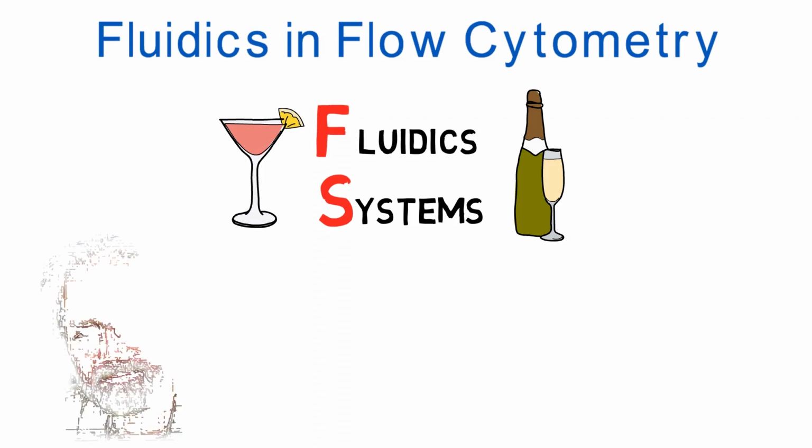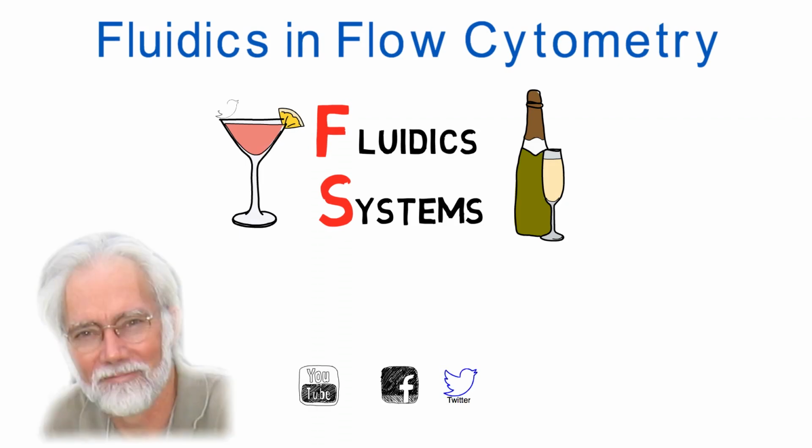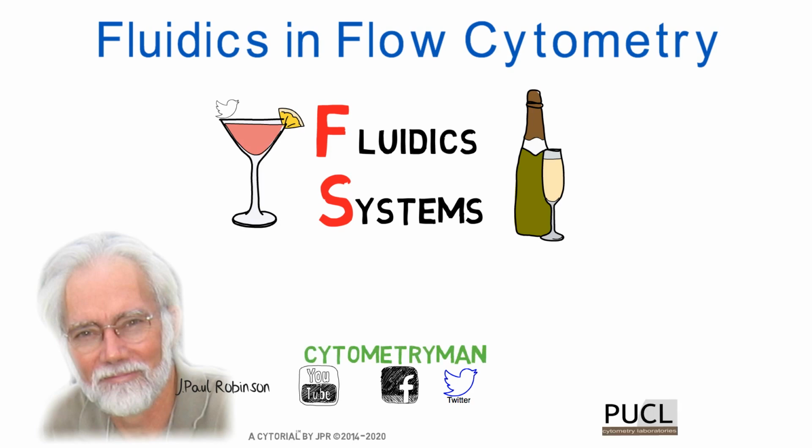In this tutorial, we're going to talk a little bit about fluidic systems in flow cytometry and understand how different flow cytometers manipulate cells and sheath fluid. Let's remember that there are some fundamental aspects of flow cytometers.